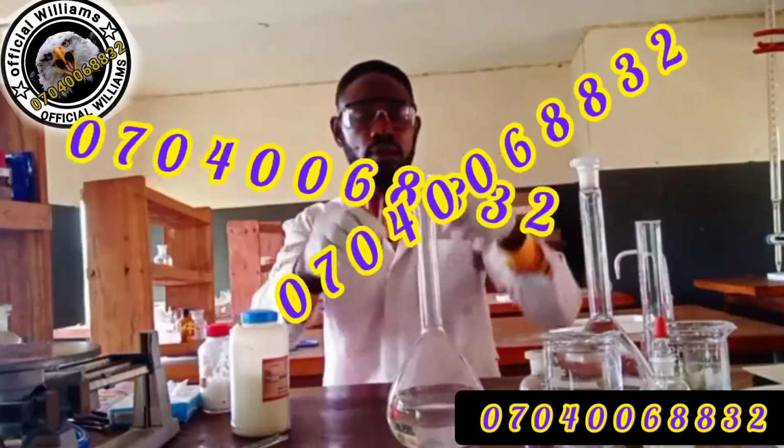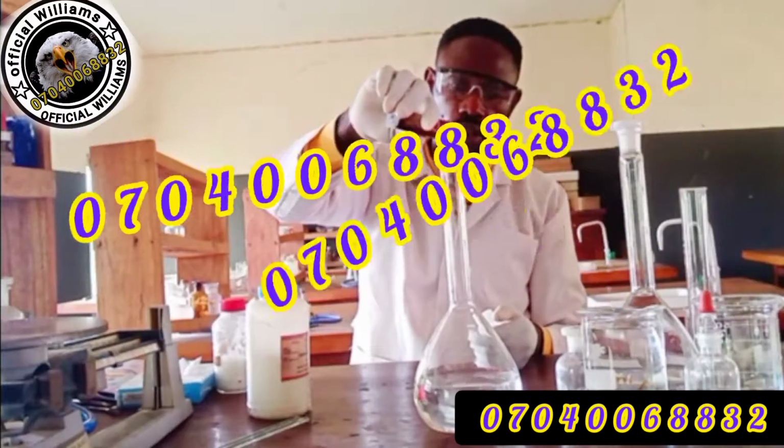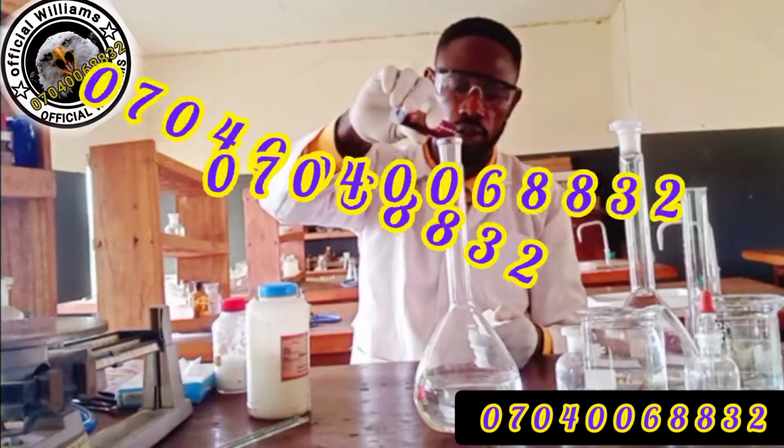So, gently, don't allow any crystal to fall off.